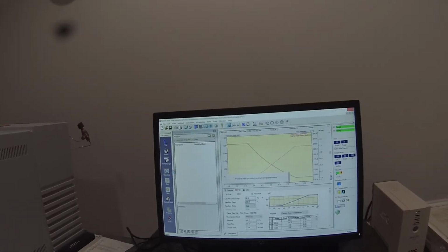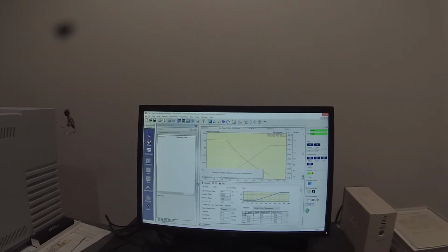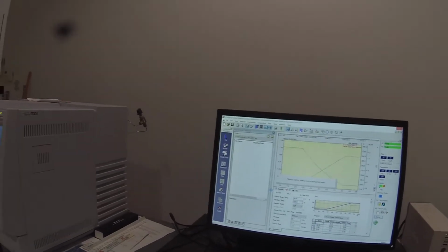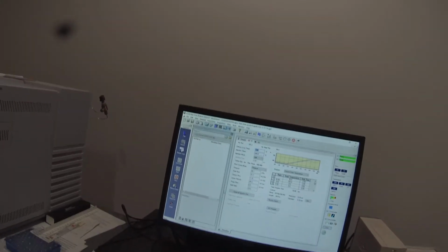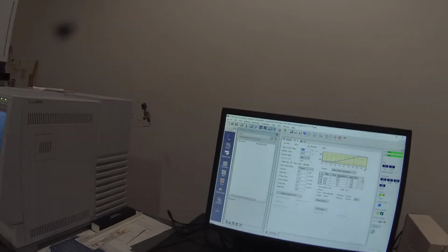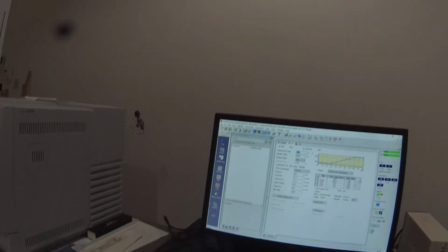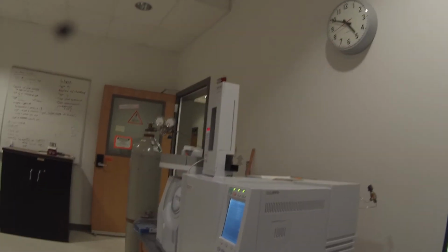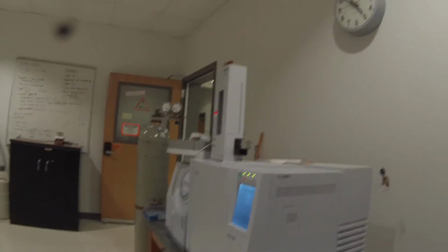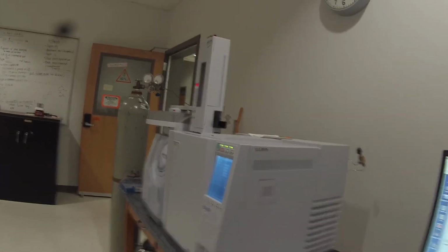And it's the standard sampler conditions that we're used to, with 2 washings with dichloromethane, since we dissolved this in dichloromethane, just as we did for the morpholine solids, and then 2 washes with sample, pumping a couple of times to get rid of air, and then doing a 0.1 microliter injection. So we can let that run, and it should automatically start once it has adjusted the parameters. You can see that the arm is going and collecting that sample from slot 1 and moving it over.